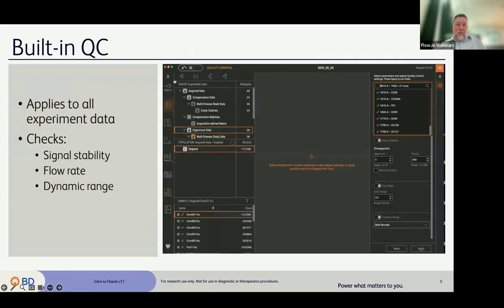And then we go down one more. So here's metadata, and then we're going to the QC. When you go to the QC, it's got all these settings over here, and you can choose to change the tunables and select which parameters the algorithms will be run on if you don't want to QC every parameter in your samples. But it will by default select all of the uncompensated parameters, and we use these defaults that run pretty well on most data that we've tested it on.